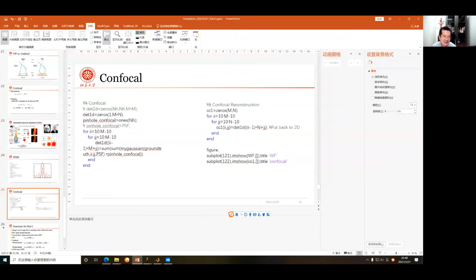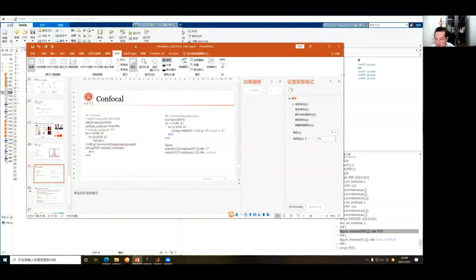You remember that? But we haven't really extended to a confocal case. So in the confocal case, you remember that our excitation would be a point spread function, which expands several pixels. Now we will define an area, and then we will scan across this area.